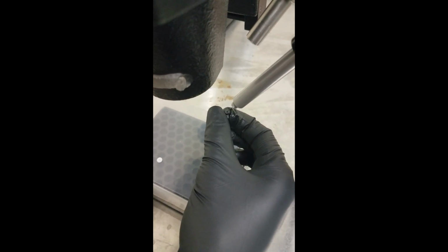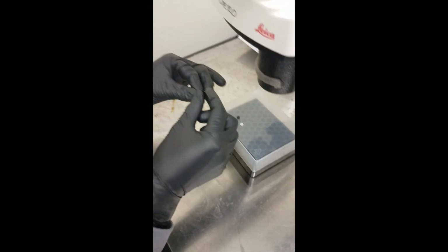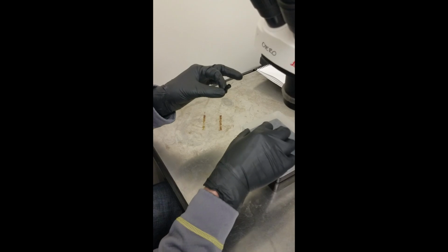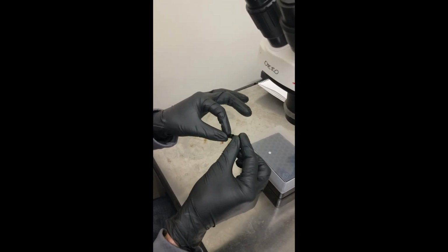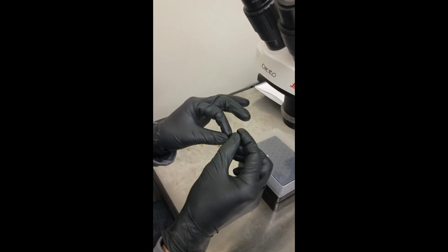So the black piece with the smallest hole goes back on this little plunger on the machine. So you can put that on right away. Do that first. Just like that. Then make sure that your glass piece is all the way through. You can take the other black piece and it goes all the way around the glass tube, like that.